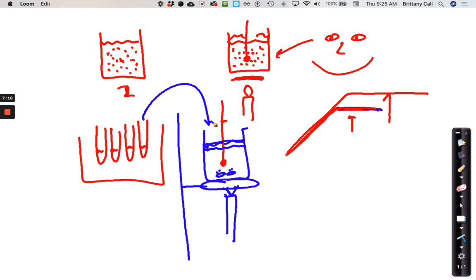Okay? So we're going to turn the heat on. We're going to watch for it to start to boil, right? As soon as the temperature looks like it's remaining constant, we're going to watch it for 2 more minutes to make sure that it is really at the boiling point. And then once it's been constant for 2 minutes, we're going to record that under trial 2. Good? Okay. Then we're ready for the next one, trial 3.